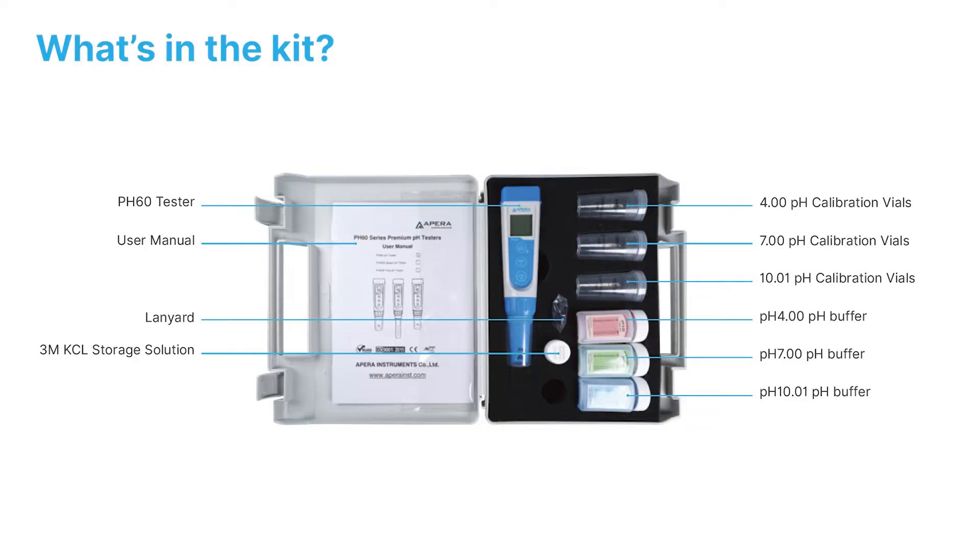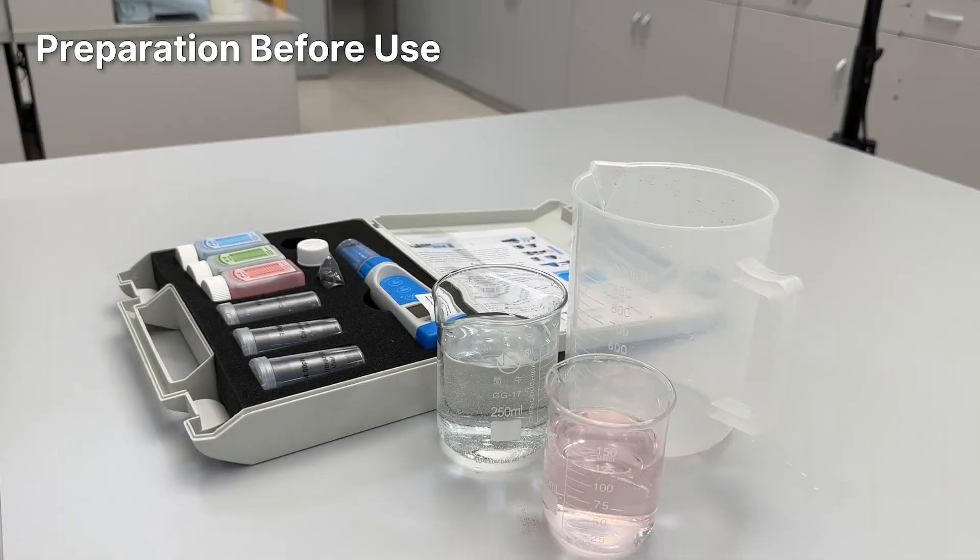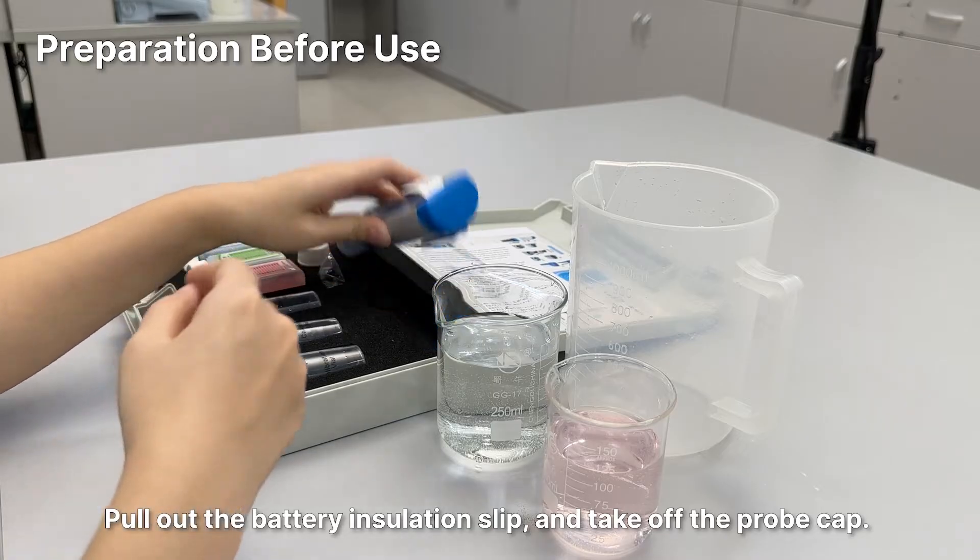Welcome to the quick start video tutorial for the Apera Premium Series PH60 tester kit. Before use, pull out the battery insulation slip and take off the probe cap.